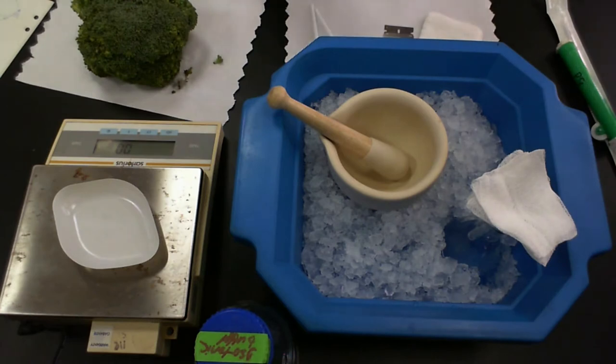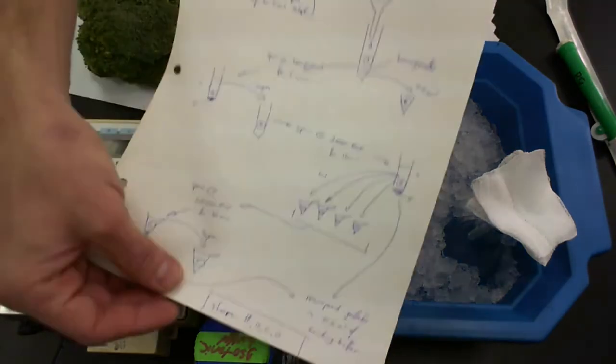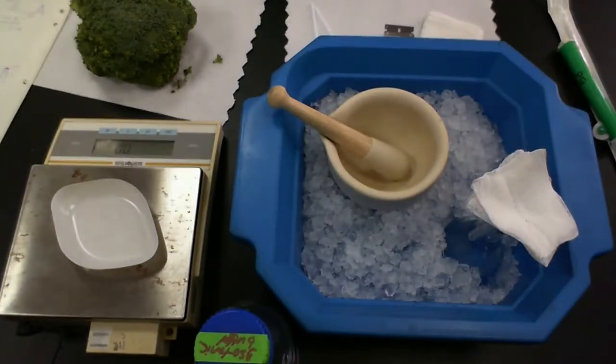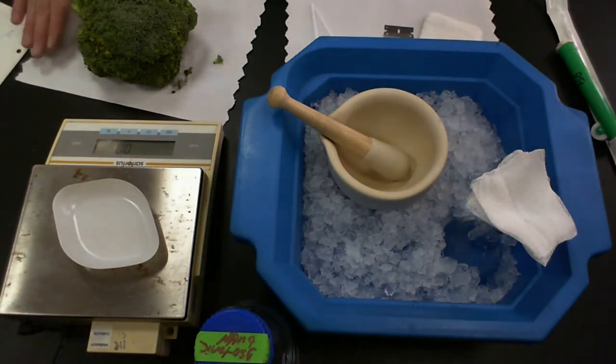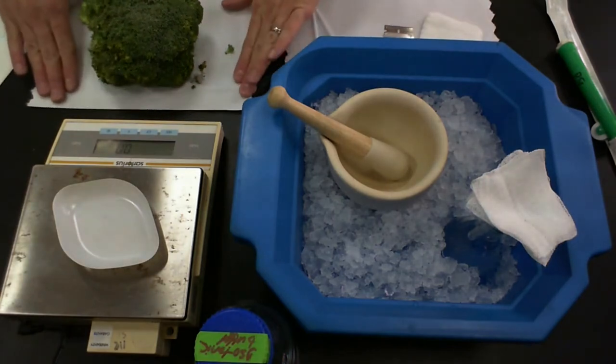What I'm going to do is show you how you prepare the homogenates, and then we're going to spin these down. So I also have my handy flowchart for today, so I have an idea of what I'm going to be doing step by step, that's close by, so I can refer to it at any time.